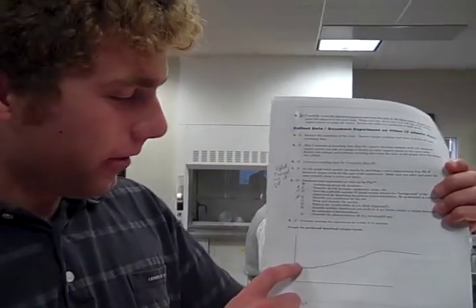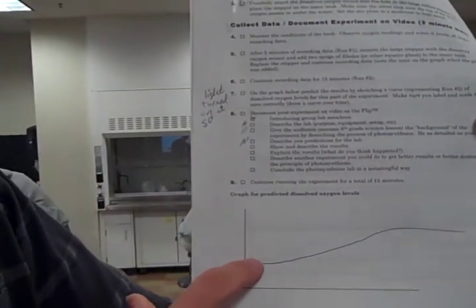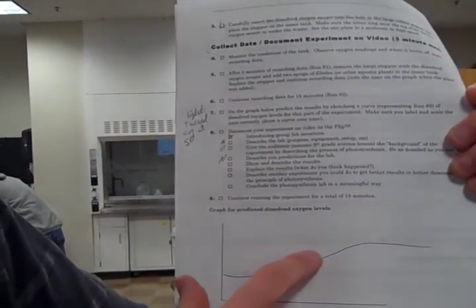Alright, my prediction for this lab is that oxygen levels will steadily increase as time goes on and the plant produces more oxygen and consumes more CO2 in the water. Here's a graph of the oxygen level versus time graph, and I predict it will steadily increase before leveling off when the water becomes saturated with oxygen.